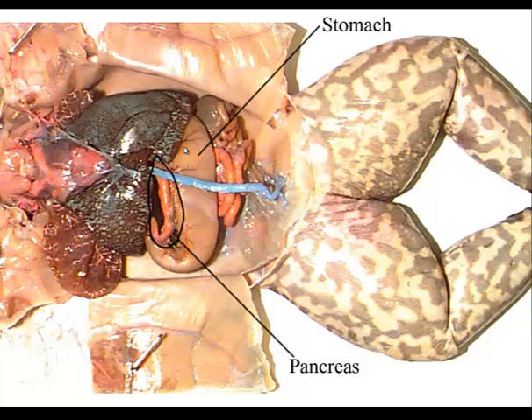Insert your probe through both sphincters so you can see where the esophagus meets the stomach at the cardiac sphincter, and where the pyloric sphincter is between the stomach and the duodenum of the small intestines.